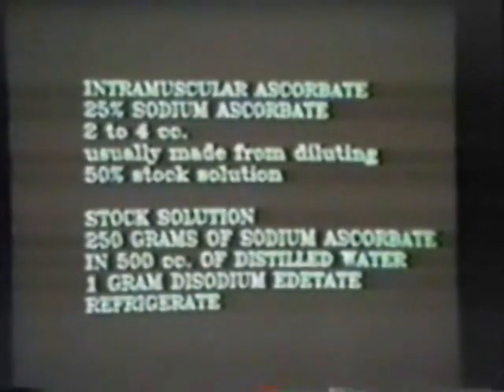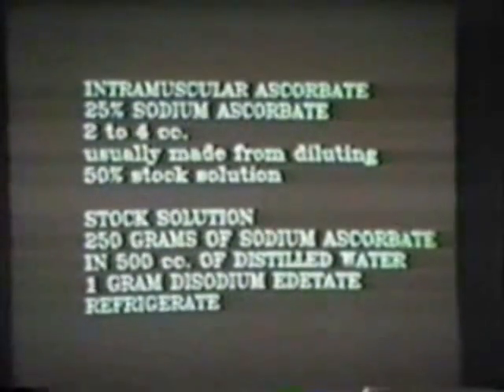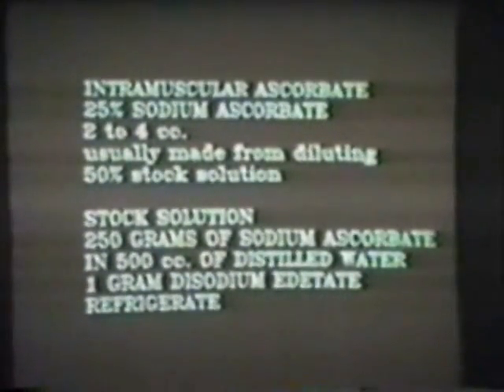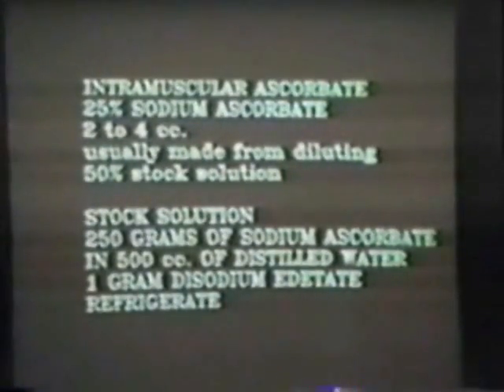Now, the stock solutions. Yesterday, just for convenience, I talked about making stock bottles of 1,000 cc, so if you have any of your figures there, they may not quite jibe. But anyway, we're trying to make a 50% solution. And what you do, I measured it out.